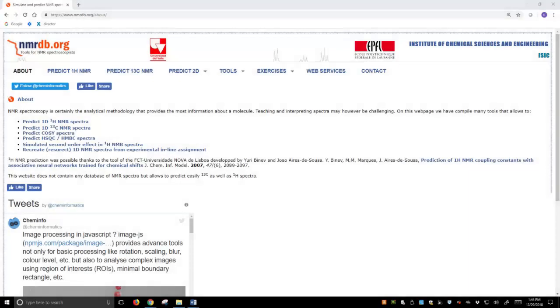All right. We're going to introduce this really cool online website that I stumbled across. I'm sure it's been out there for a while, but the website is called nmrdb.org, nmrdatabase.org.